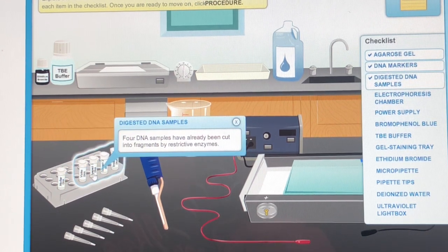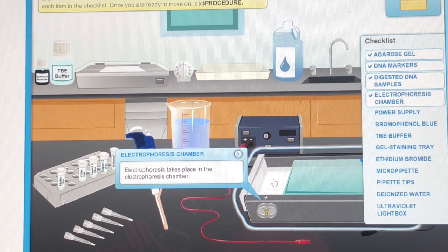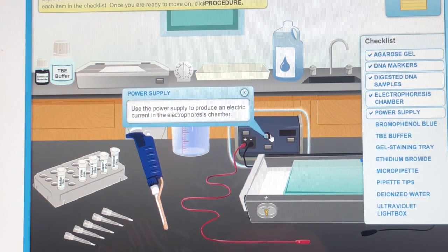Digested DNA Samples: four DNA samples have already been cut into fragments by restrictive enzymes. Electrophoresis takes place in the electrophoresis chamber. Use the power supply to produce an electric current in the electrophoresis chamber.